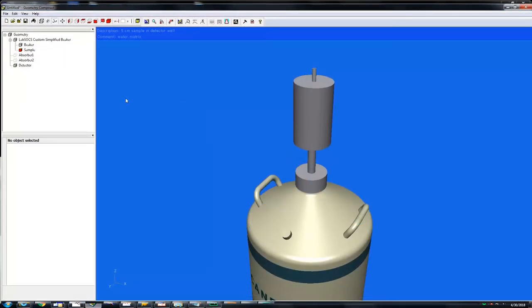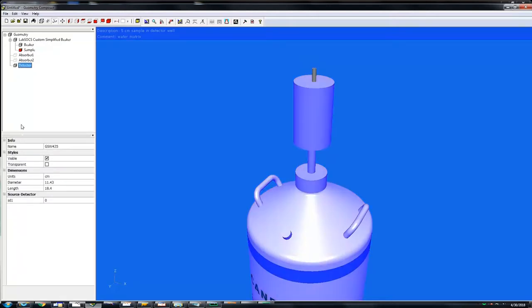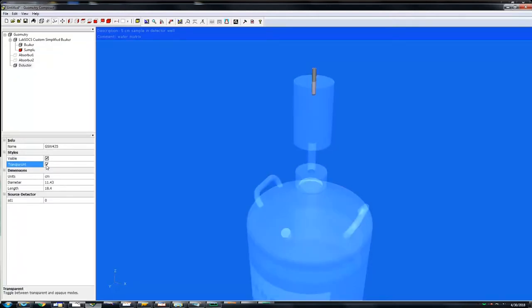Click on the detector to open up parameters. Click the checkbox next to the word transparent. Now we can see the container clearly within the well of the detector.